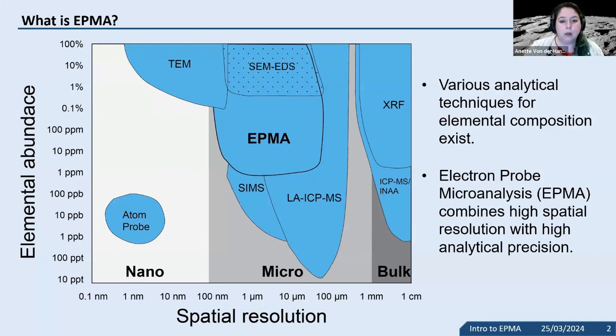And one other large advantage is that with a few tips and tricks, we can usually acquire all the way between ppm levels of concentrations all the way up to 100 weight %. And so it's very versatile, and we can determine compositions on a single spot, whereas a number of other techniques either are not as accurate, or not as precise, or you have to split analysis a little bit into major, minor, and trace elements, or you can't even reach one or the other.